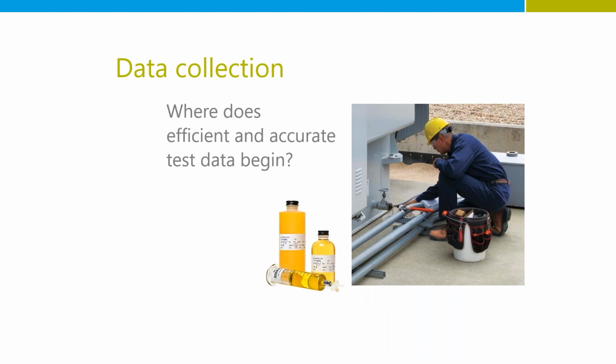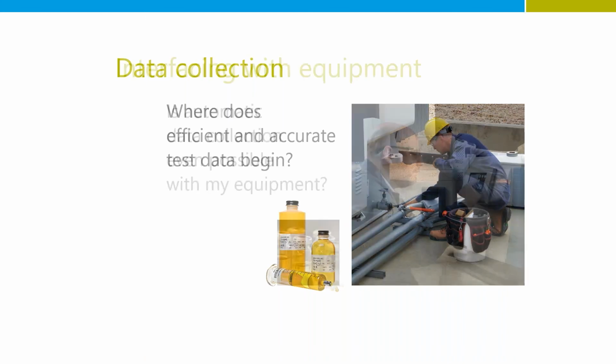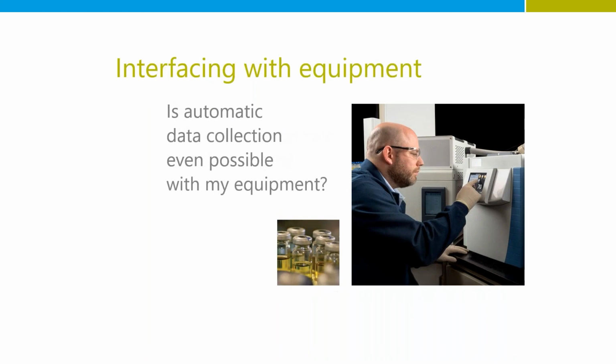So I'm going to move just very quickly to that next step in the process, which is, okay, so the sample has been pulled out in the field. You've collected all the appropriate data, hopefully using some type of technology, so that you don't have to rekey or re-enter data twice. You've registered the data in the lab, so you know that the samples are there. Now it's time to route those samples through your lab and actually start coming in contact with your instruments.